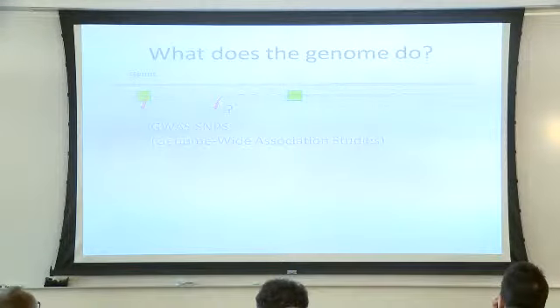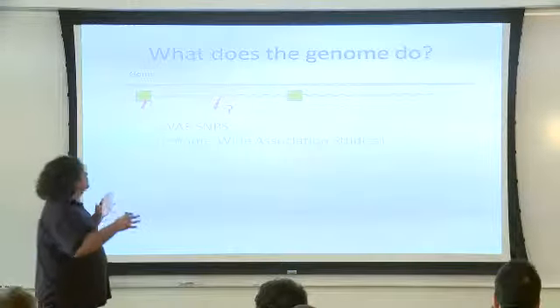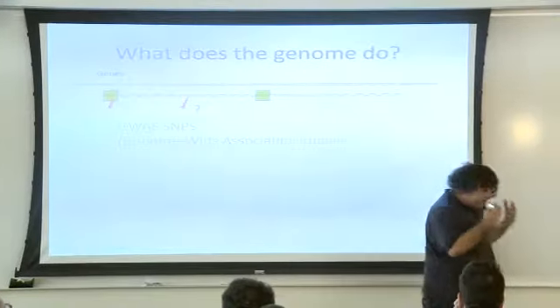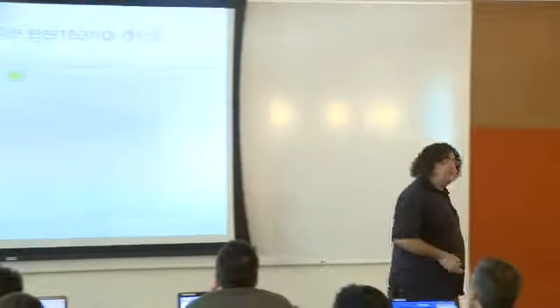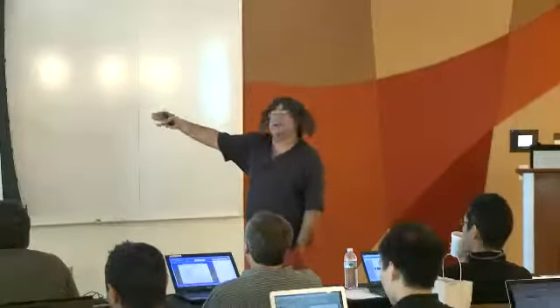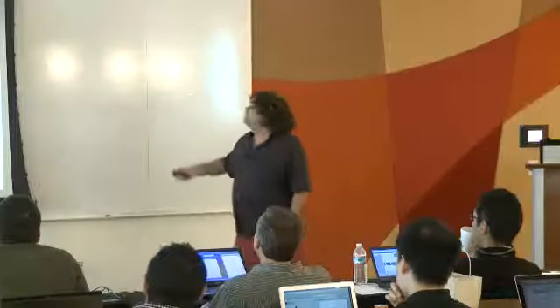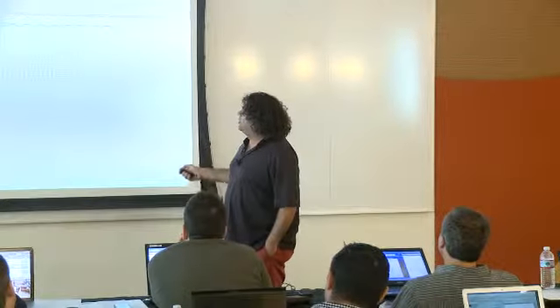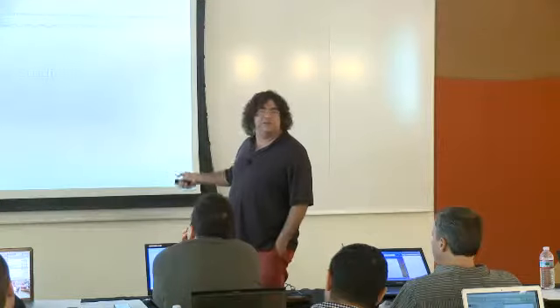And what I would like to describe to you in part today is how the type of data that you acquire with ChIP-Seq helps annotate big parts of the genome that until now were not annotated, so that we do have a better idea of what a mutation somewhere here may be doing.